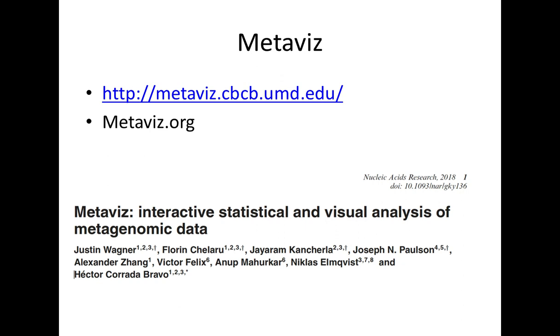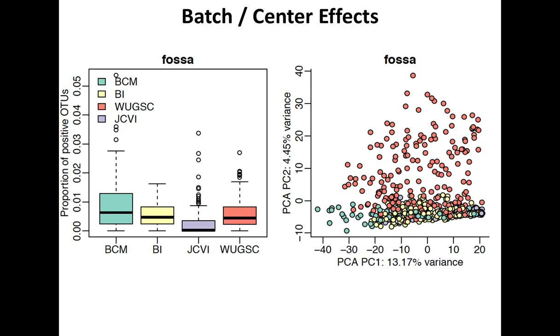Really, that has, I think, 70,000 samples loaded already into the interactive visualization browser. Essentially, go to the links on this webpage, and you can see and play around with some of the data. In the article itself, there are a couple of figures that are static, and you have the ability to go and directly get linked to them.